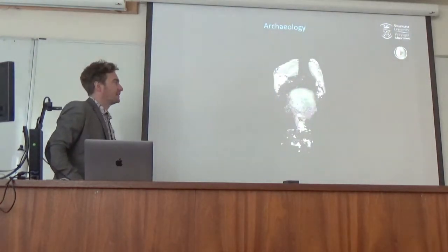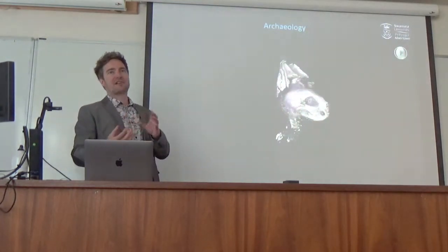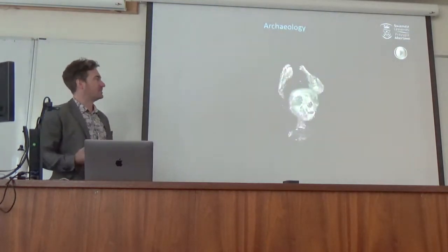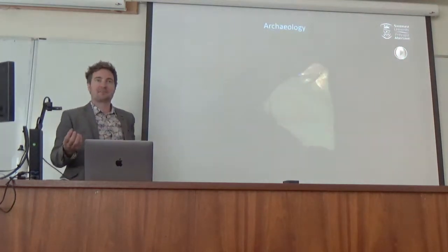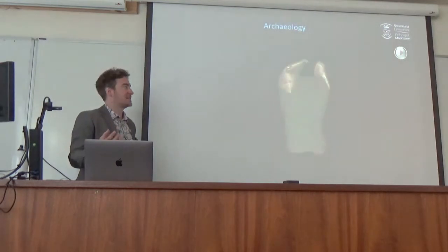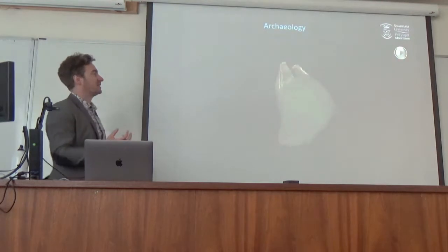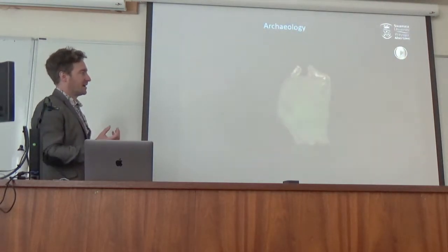So these are around 2,000 years old. They look like a bundle of rags. You saw just before, this was digitally unwrapped, it actually looked like a cat. But on many occasions those wrappings that might look like an animal contain nothing, or they might contain one individual bone, whereas this actually is a really good example where it definitely contains a cat.